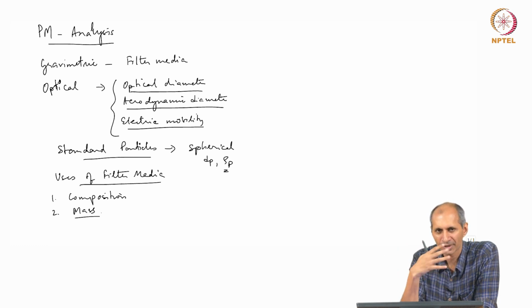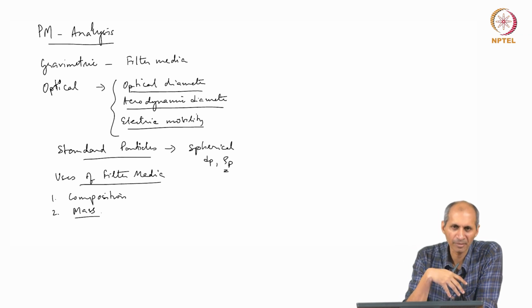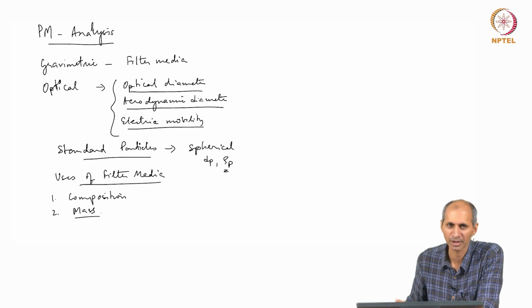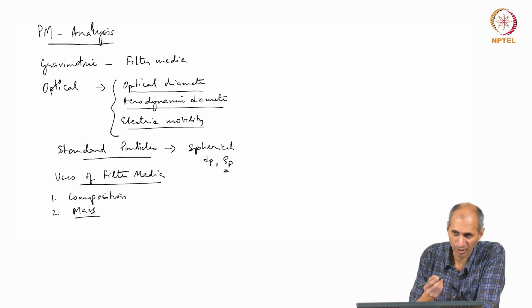So physical mass shows that it is there. Even though it doesn't give you full information, it gives you very staggered information. It gives you time average information, but it's still there. It's physical evidence that something is there. So that's one of the main advantages why a mass-based detector is still used.